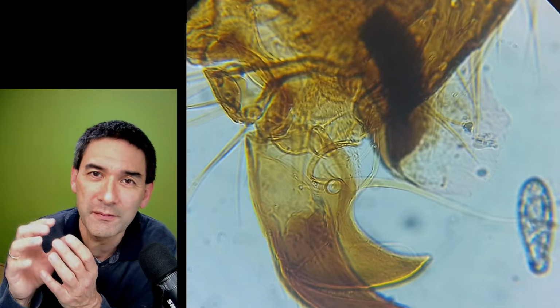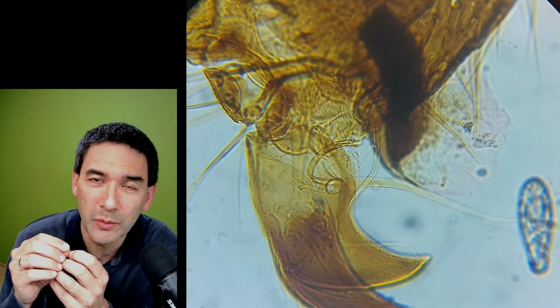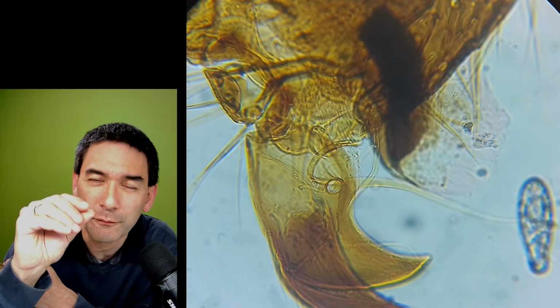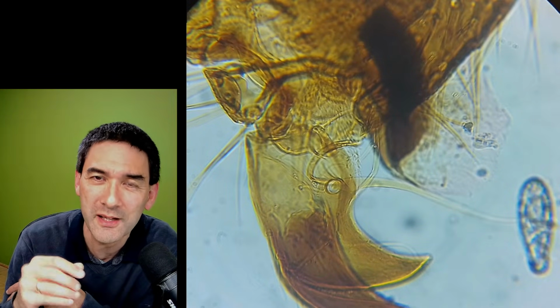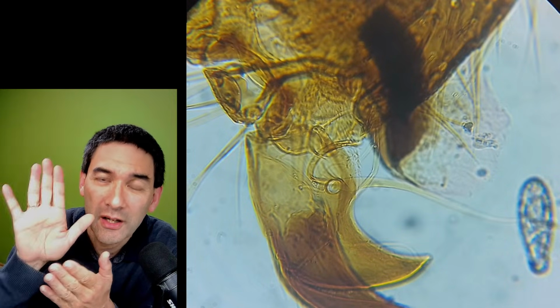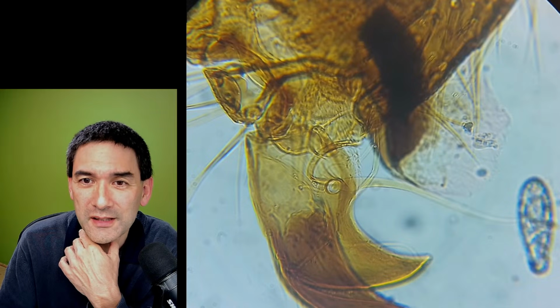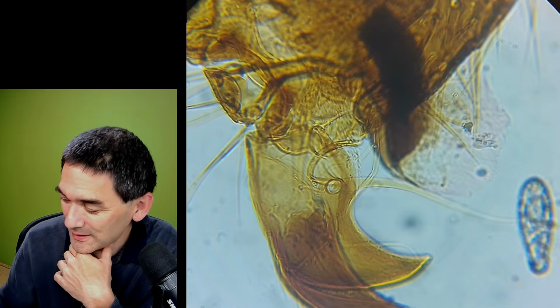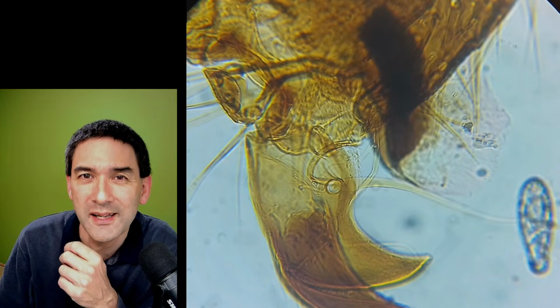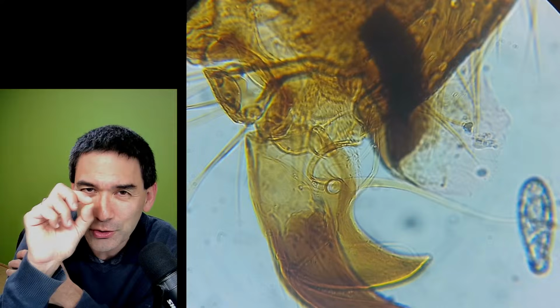They took photographic film and made tiny pictures on it, and then put the film on a microscope slide, so you could look at pictures and read text under the microscope. That's something that's been a little bit forgotten these days, but it's an interesting thing. And I know that there are some antique slides that can be bought that have tiny pictures and text and so on.